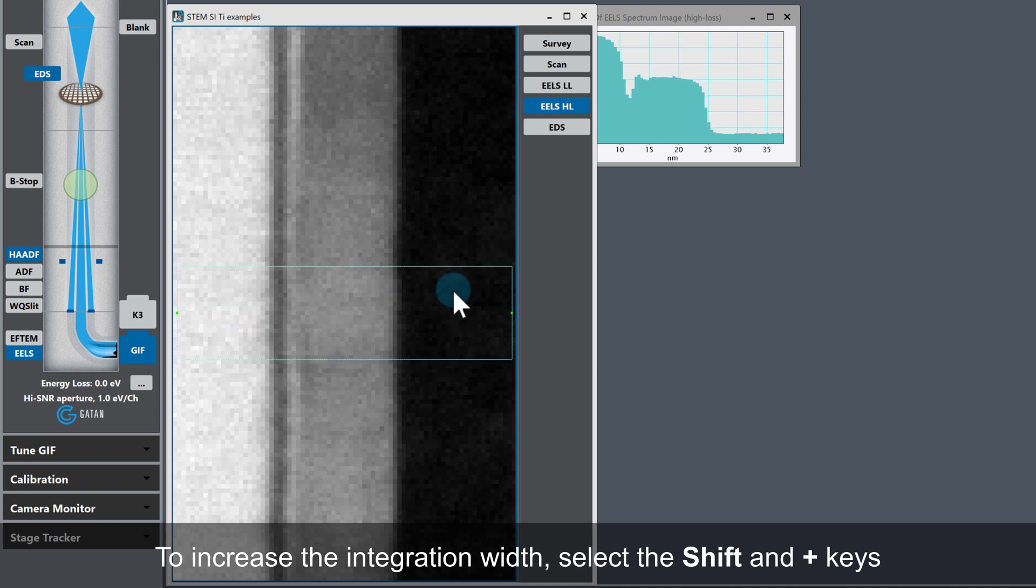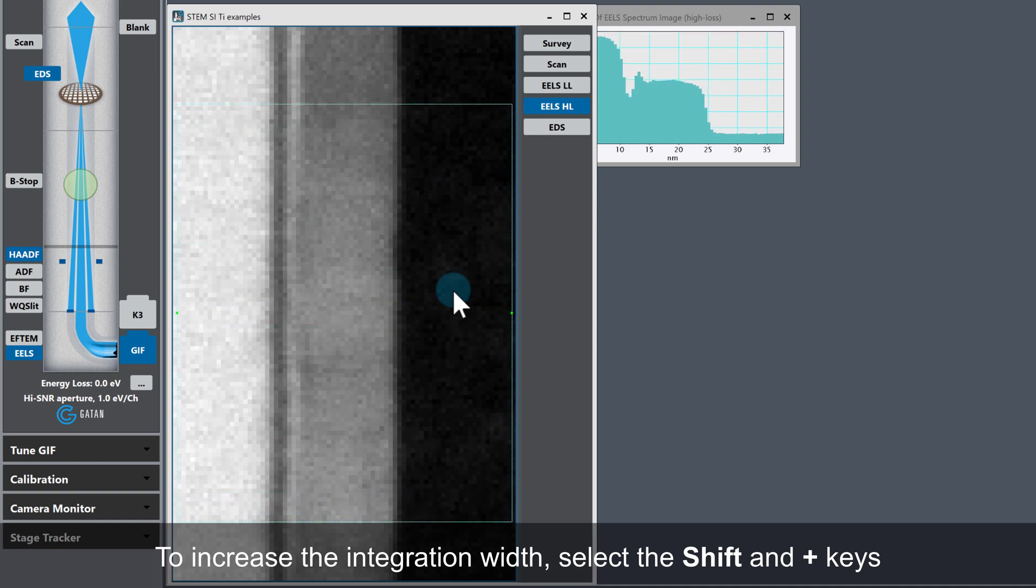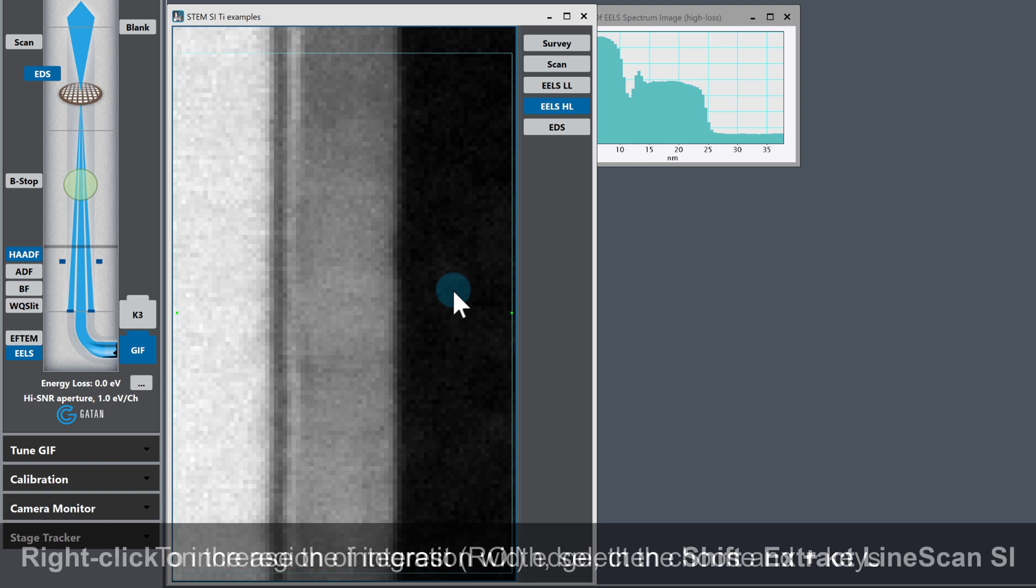You can see the line is placed approximately in the center of the spectrum image.